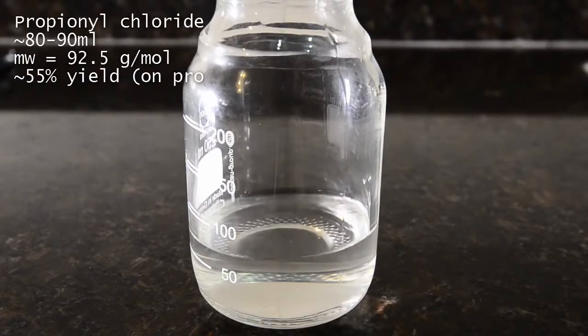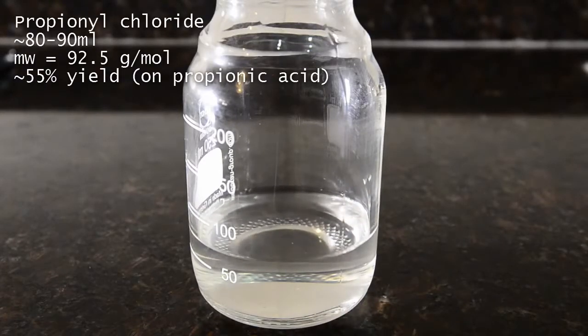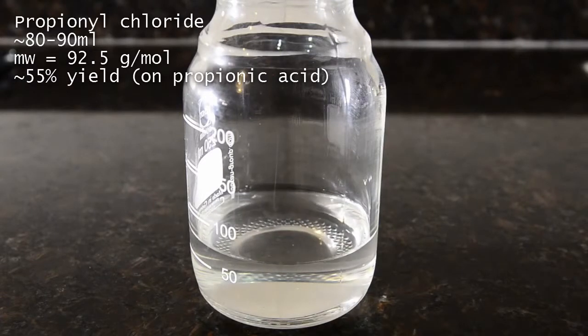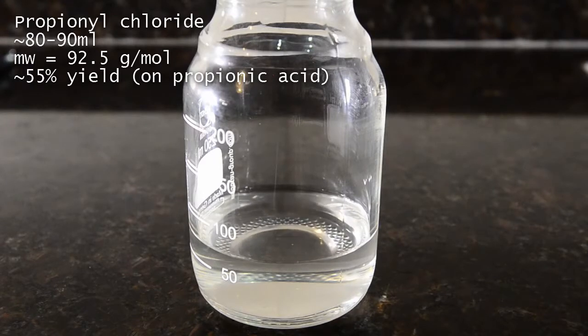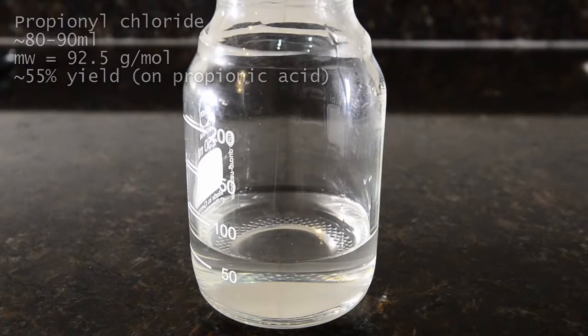Here's our product, around 90 ml of propionyl chloride. This is around a 55% yield, which should be higher but we think our current batch of propionic acid does contain some impurities which lower this.